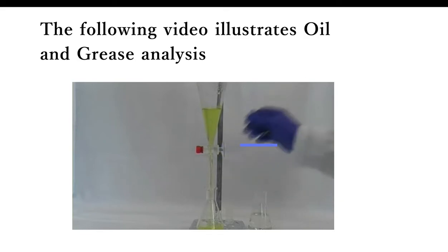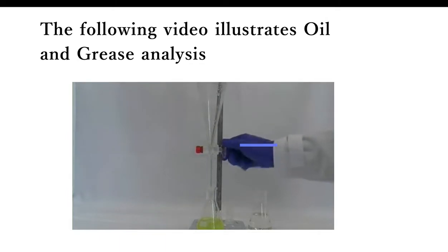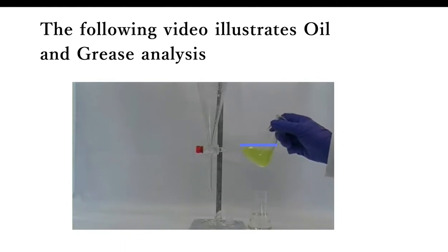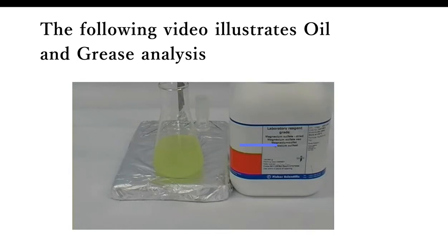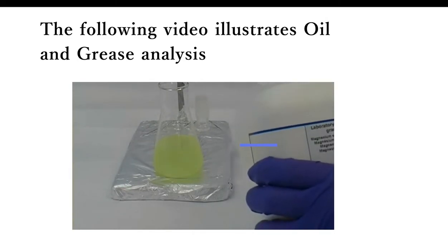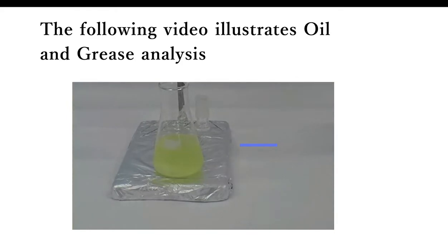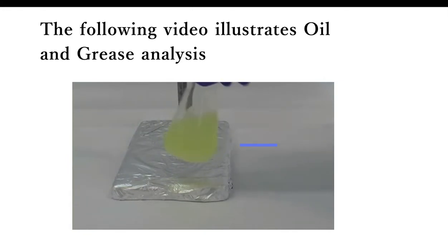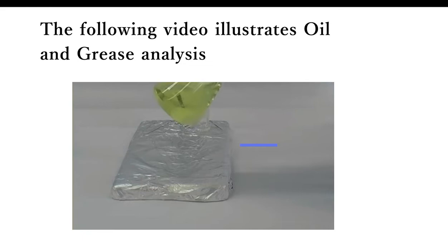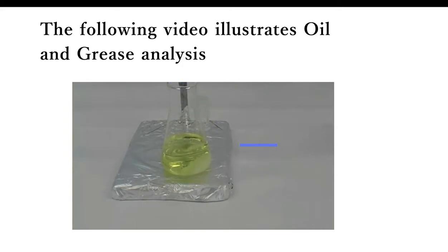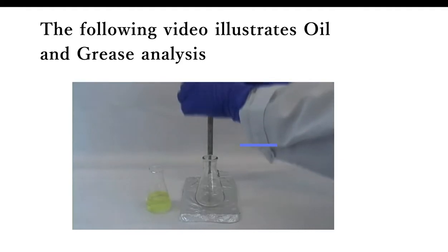After separating the phases, collect the organic phase containing your desired solutes in a conical flask. All that remains is to remove residual water. Drying is achieved with anhydrous magnesium sulfate, which attracts water molecules and removes any residual water from your organic phase. After adding a portion of magnesium sulfate and swirling the solution, if you are left with chunks you need to add more. If you have a flaky suspension of magnesium sulfate, as in this example, you have effectively dried your solution. All that remains is to separate the solid from the liquid by standard filtration.